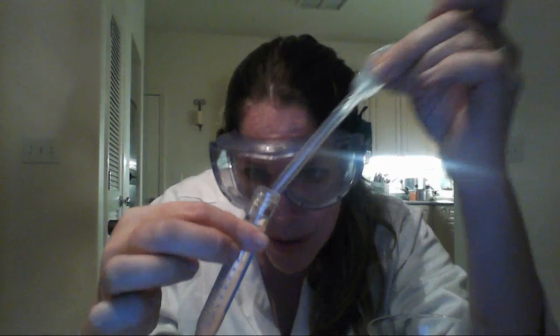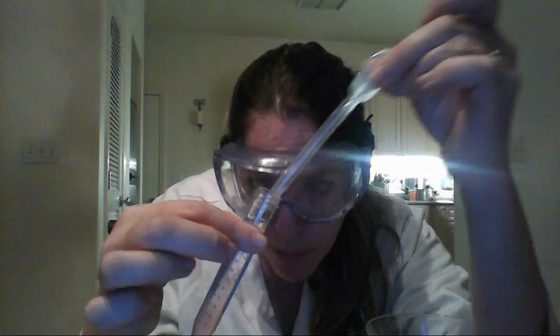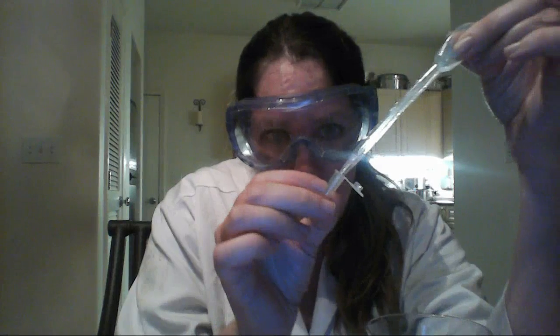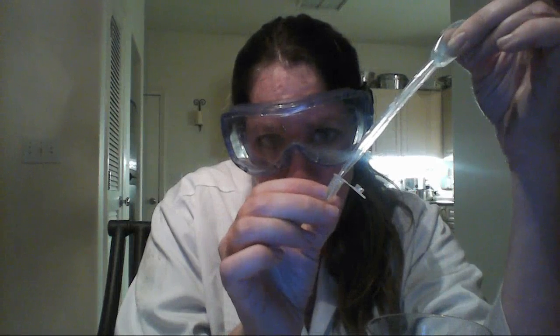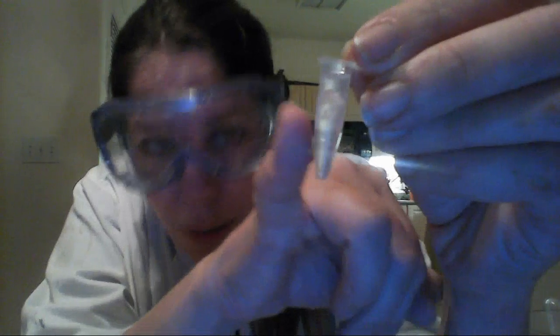Ooh, yeah, you see that snotty looking stuff? That's DNA. Okay, so I'm pulling up as much as I can. And now you're just going to very gently, with as little liquid as possible, squirt it into your tube here. Because the lysis buffer has a little bit of pink dye to it, you might get a little bit of a pinkish tint. So let me see if you guys can see that. You see all that kind of clumpy stuff in there?